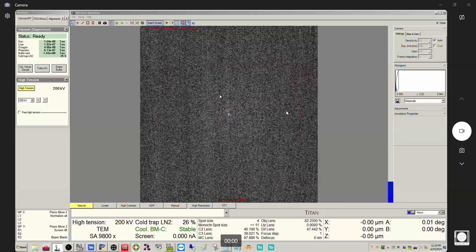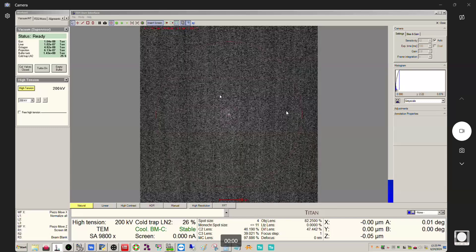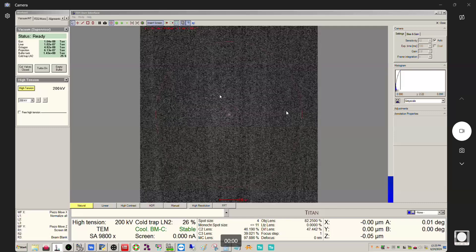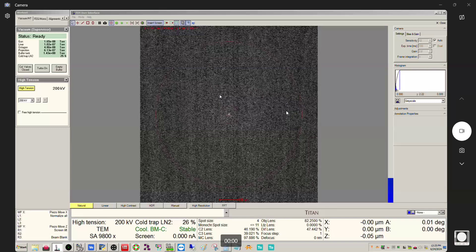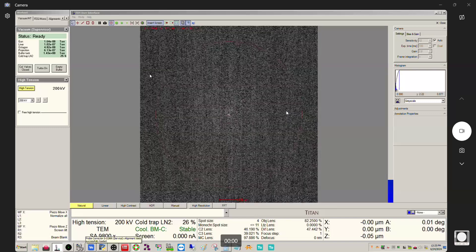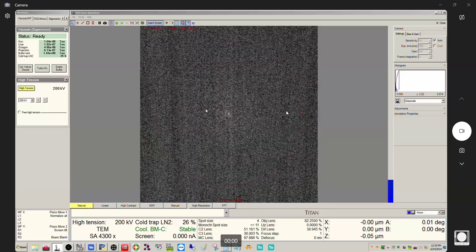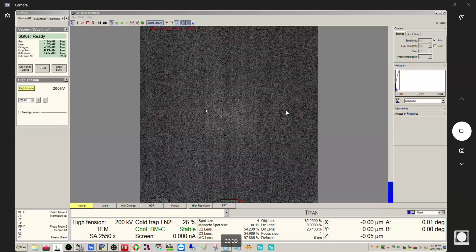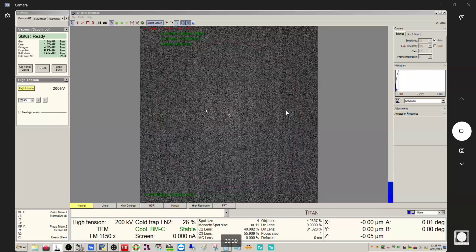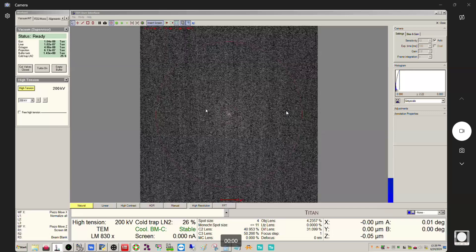So there are really three possible reasons why we're not seeing anything, and it's entirely possible that more than one of those factors is at play. The good news is that the way to deal with any of those situations is exactly the same: just decrease the magnification until we see something. Right now we're in SA mode at a fairly low mag, and we're going to keep going down. Because this is a Themis there's no M mode, so we go straight from SA to LM mode.